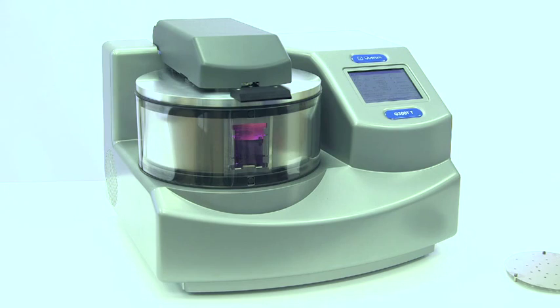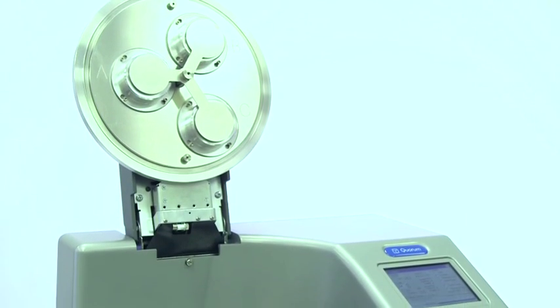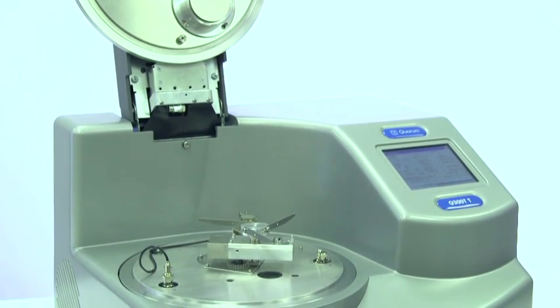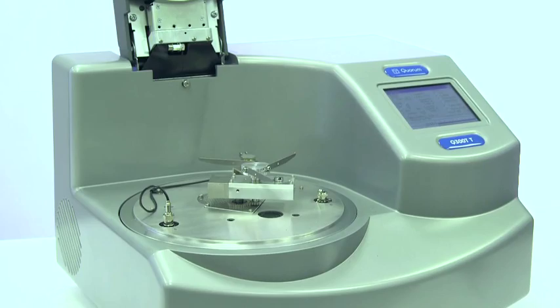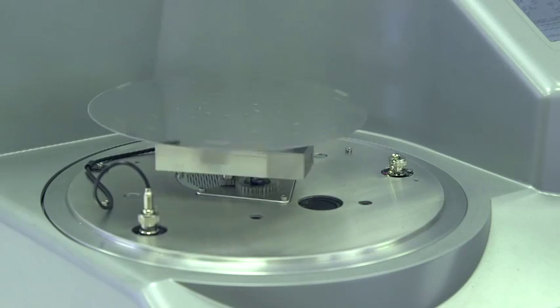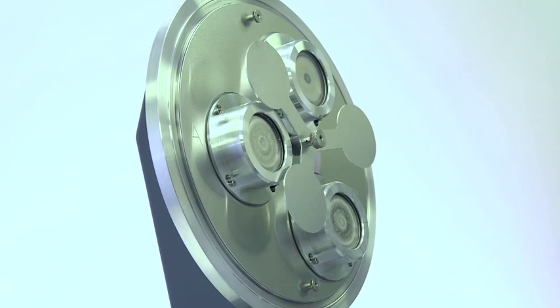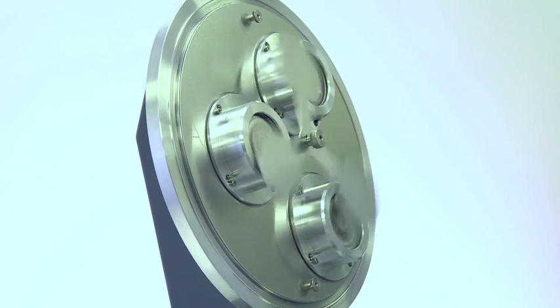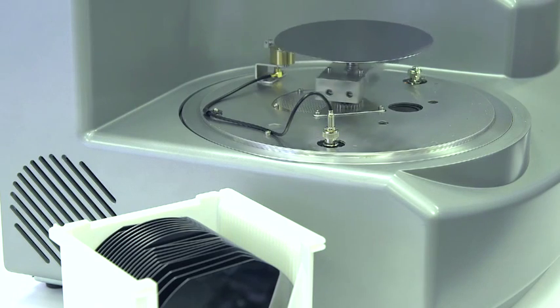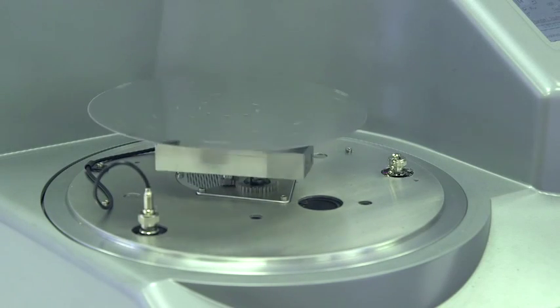For larger samples, Q-series coaters are available in three large-chamber Q300 versions. The Q300TT is a turbo-pumped high-vacuum system for coating samples up to 200mm in diameter with oxidising and noble metals. The system is equipped with three sputter targets and a stage with rotary planetary motion to ensure uniform deposition over a full 200mm diameter.